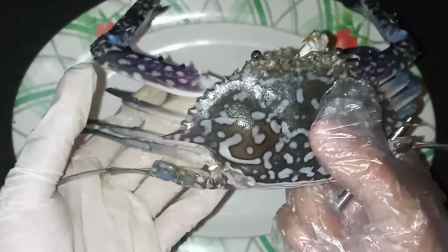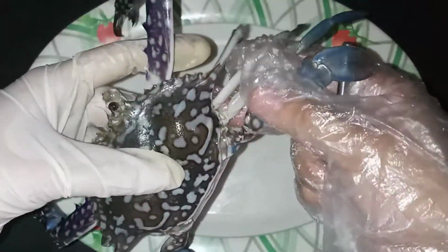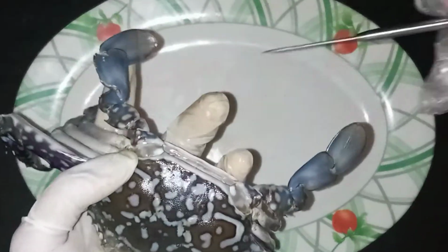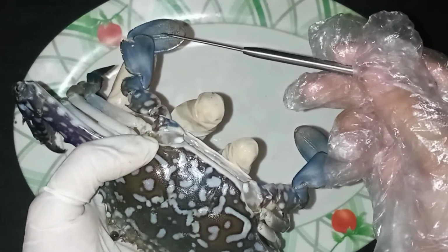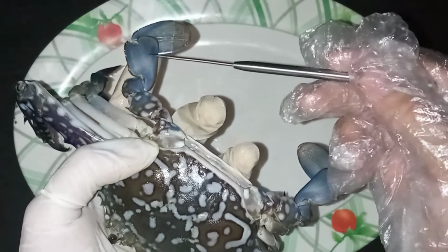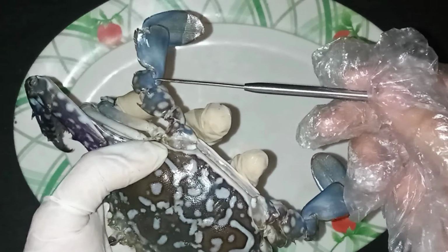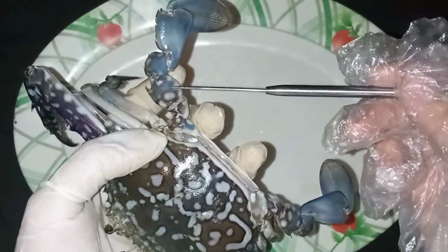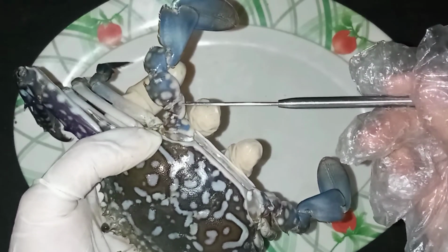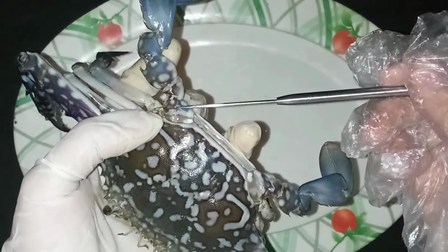Usually a crab has five legs, or five pereopods, that are located on both sides. The two pereopods that are located at the posterior side of the crab are called the swimming legs. This part is called the dactyl. This is the propodus, the carpus, the merus, the basiischium, and the coxa.